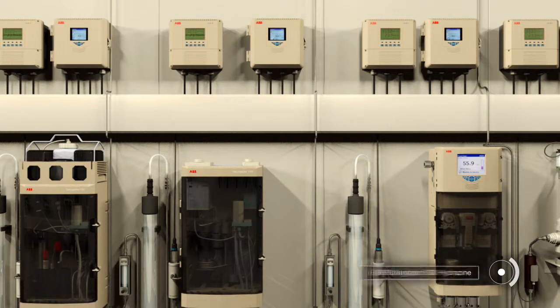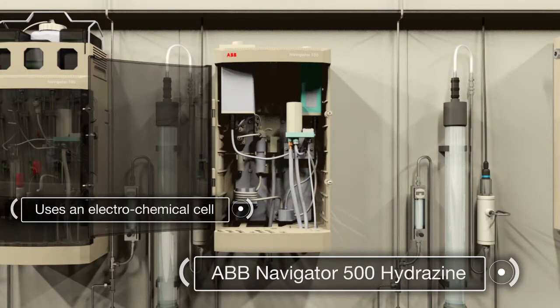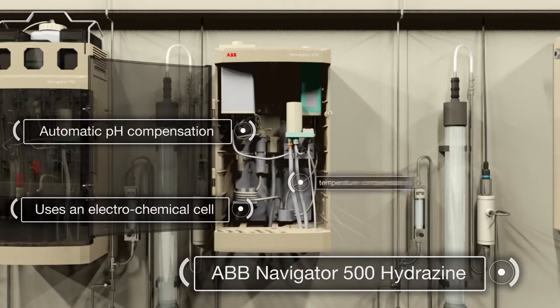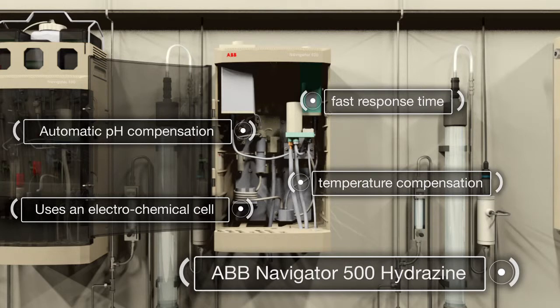ABB's Navigator 500 Hydrazine uses an electrochemical cell to accurately measure the levels of oxygen scavenging chemicals such as hydrazine in boiler feed water. This accuracy is reinforced by automatic pH and temperature compensation, which coupled with fast response time help ensure that readings reflect the actual feed water conditions.